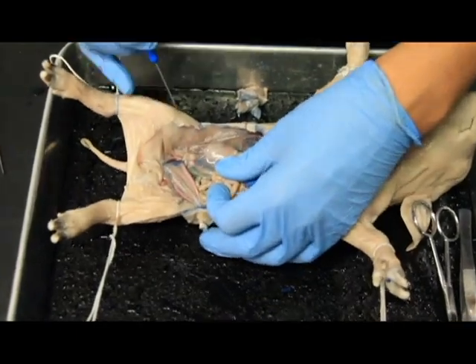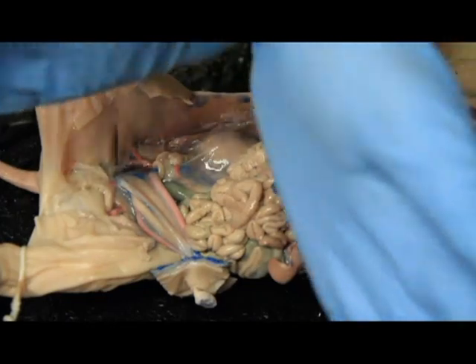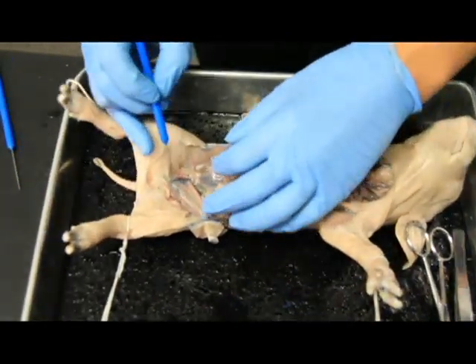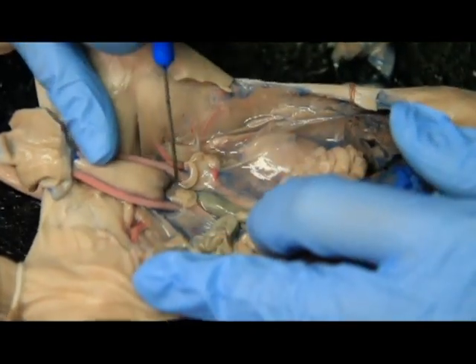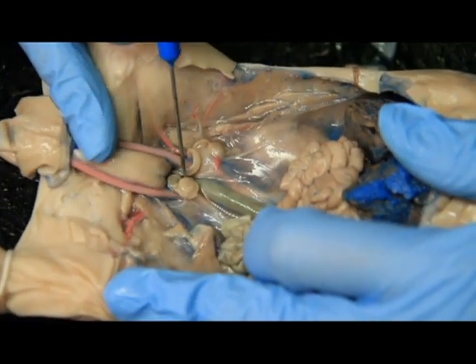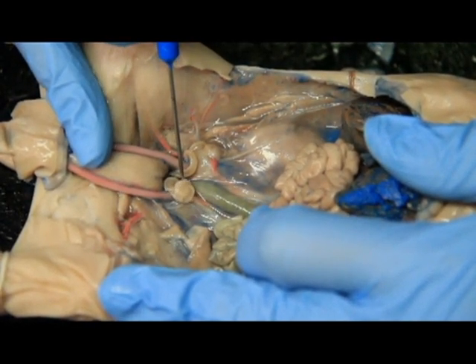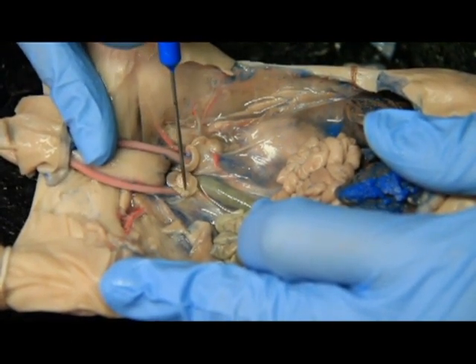Okay, so again, this is a female reproductive system, very similar to a male in that Y shape, except that Y shape out here is going to be the horns of the uterus, and the body of the Y is going to be the body of the uterus. So we've got one of our branches out here, remove this, and our other branch out here. Now at the very ends of our branches are going to be these tiny bean-looking things. And these little bean-looking things are going to be her ovaries. So just as in the male it was his testis, this is her ovary. Sitting on top of that ovary, this little guy right here, is her oviduct.